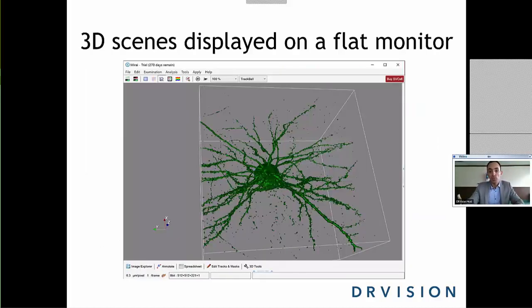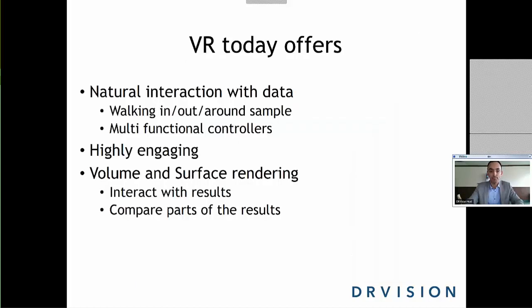And we do have, of course, software like what we will show you today, and there are others before, that can render in 3D and allow you some level of navigation in 3D and even making some animations. But it's still very limited. And that's what we and others are now trying to solve using virtual reality as a way forward.